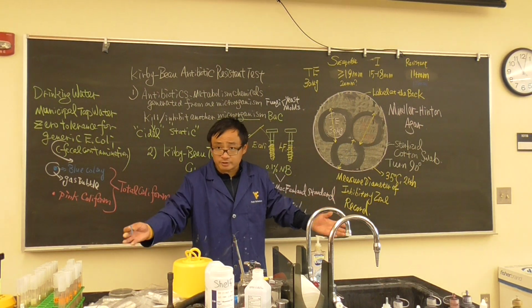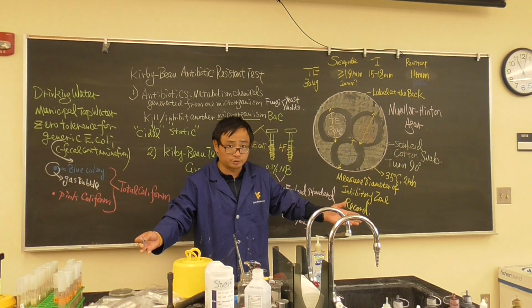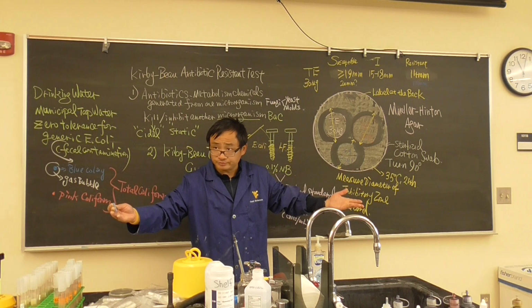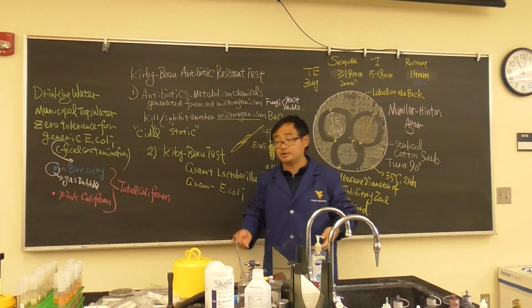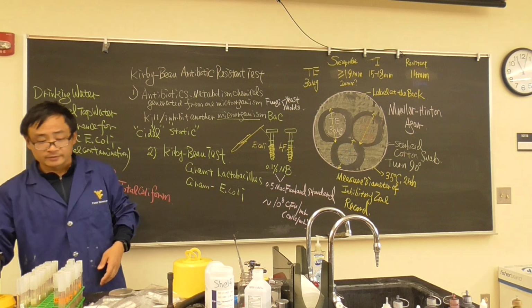Clinically, that means for this patient, you cannot use tetracycline for the treatment because the bacteria cause resistance. Now if you get something like 17 millimeter, that means it's intermediate, and clinically you still cannot use it. So that's what we do.